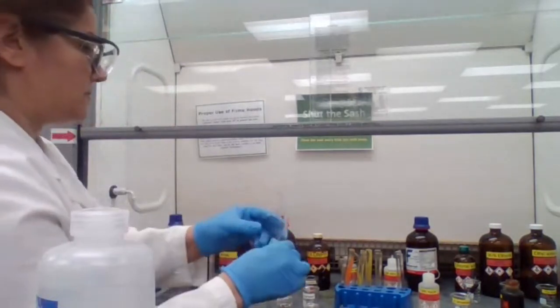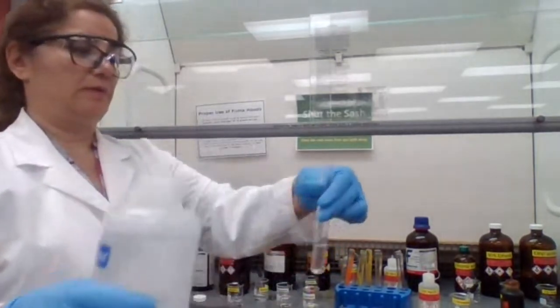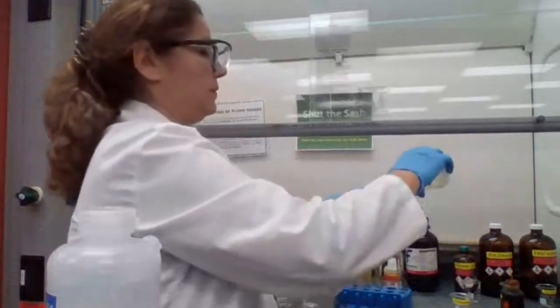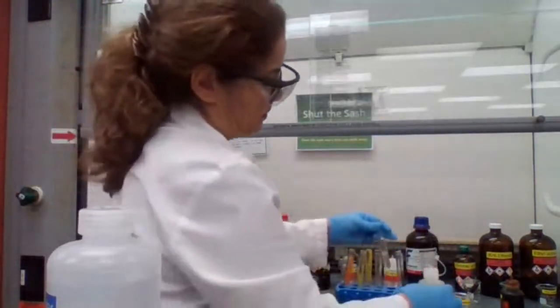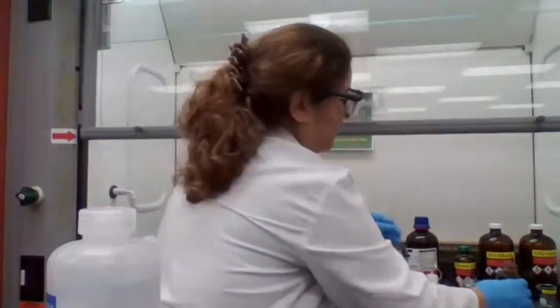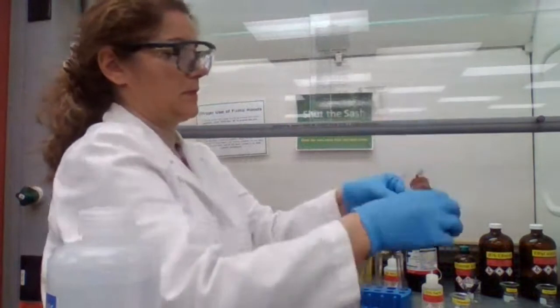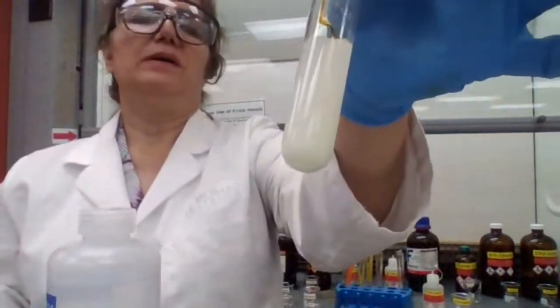Acetone and water. This one doesn't need the dimethoxyethane because it's already soluble. See the yellow color?